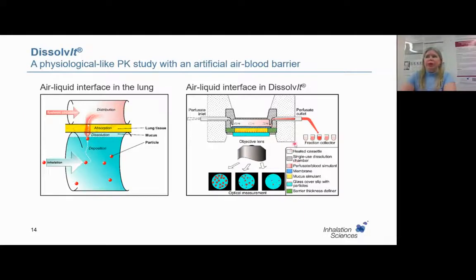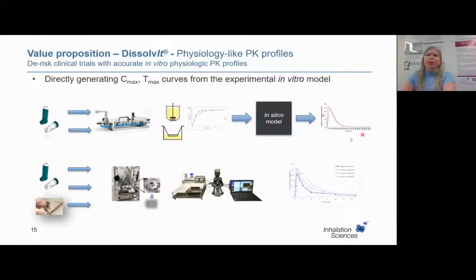So this is the way we try to simulate the physiology of the airways with Dissolvit. And here is just a comparison between Dissolvit and some other more conventional or more used methods used today.